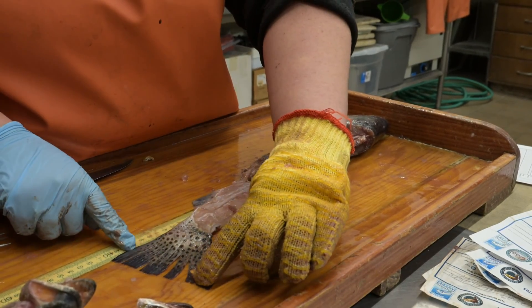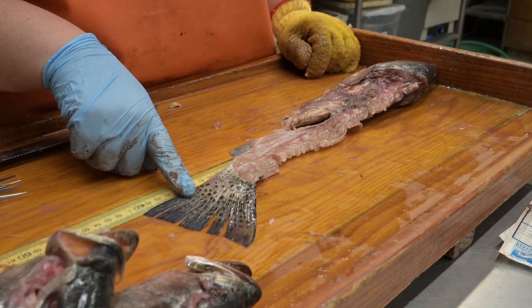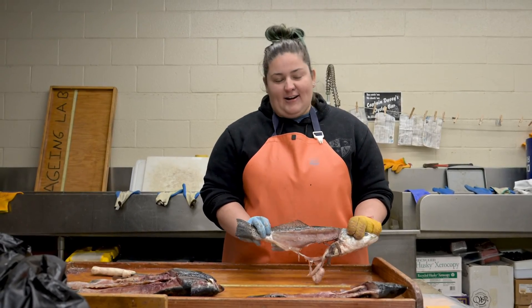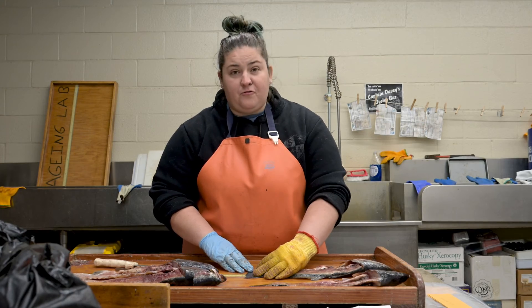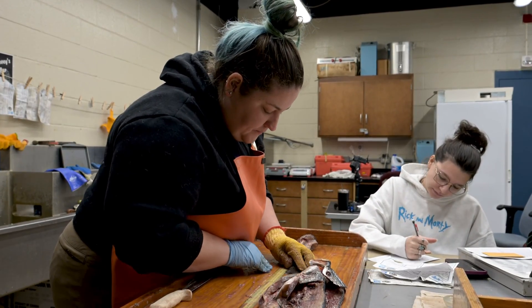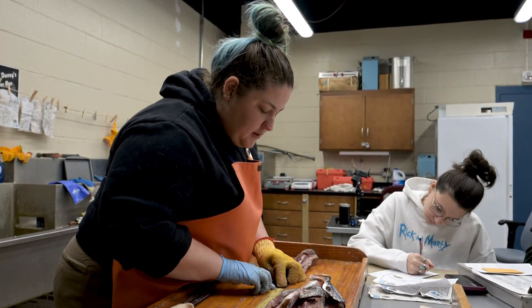I can tell that it is a speckled trout even though it's a carcass by looking at the tail and noticing that these spots come all the way onto the caudal fin. With our filleted carcass, we're going to take a length measurement. Starting with the fork length — our fork length in millimeters is 415 and our total length is 421.